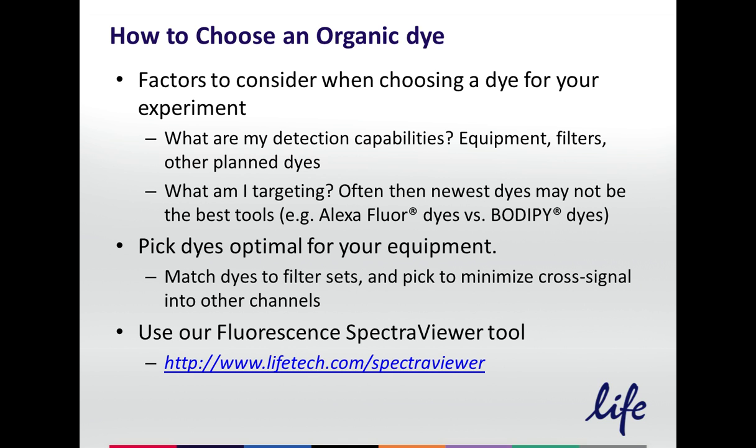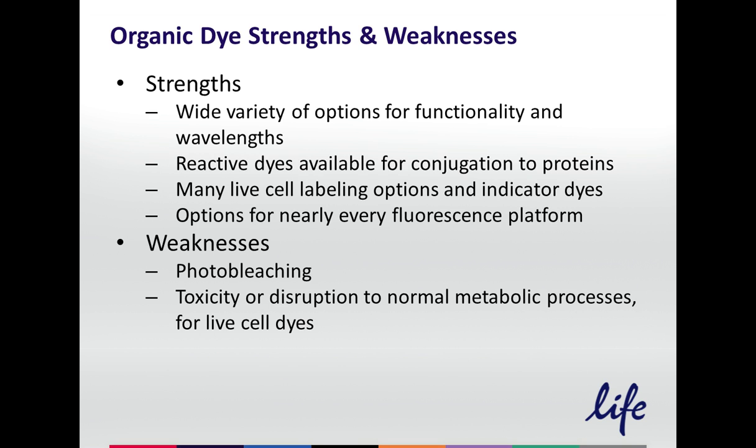So what filters do you have? What is your light source? If you're using a laser-based system, what is the laser wavelength? And does it match the excitation of your dyes? If you're multiplexing, that is multiple labels on the same sample, do the dyes overlap? If so, that may cause bleed-through problems between the filters and dyes. So you want to make sure that you use dyes that are separated well enough that you're not going to have a problem. Again, the spectral viewer and other dye choosing tools will be helpful for that.